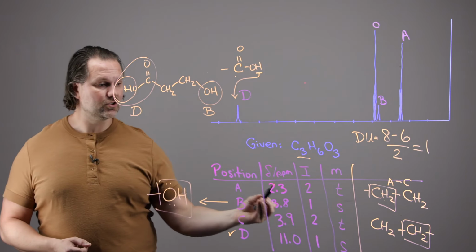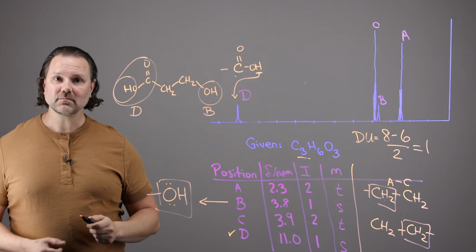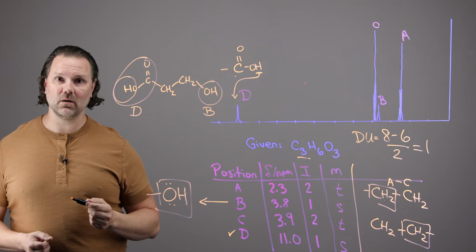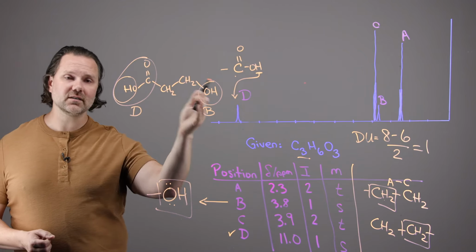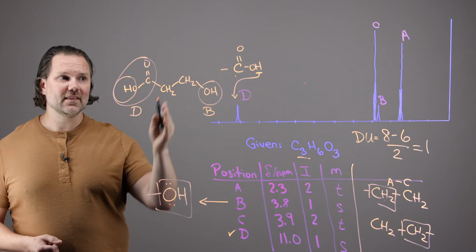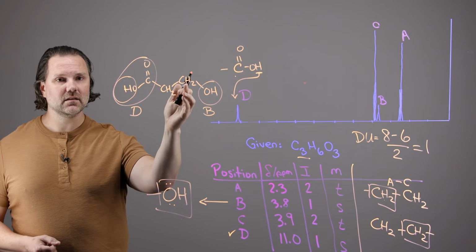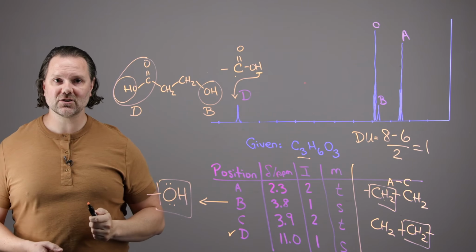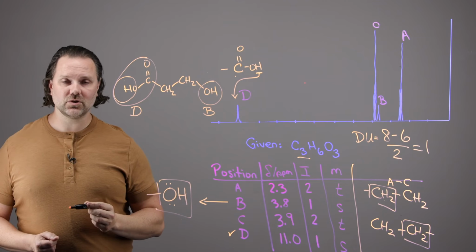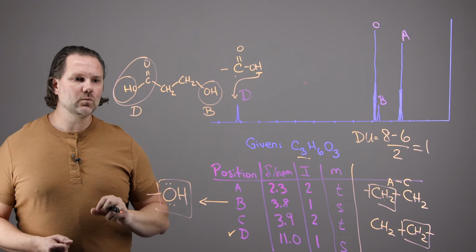The alcohol will show up as a singlet, and then those neighboring protons, in turn, don't couple with the alcohol, and so they will not experience any splitting due to it, only due to other neighbors. That's why this CH2 is showing up as a triplet, not having additional splitting to a quartet or some other option due to that alcohol.